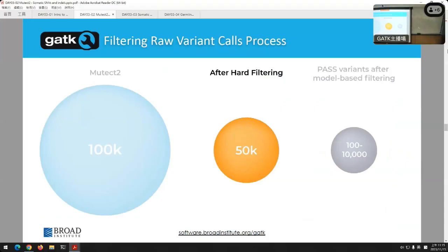Remember, in this case in particular, even more than basic germline calling, we're really trying to minimize those false positives. So even after we come out of our modified haplotype caller in MuTect2, we do another phase of hard filtering that would further whittle down. Like if you start with 100,000 potential variants there, we might get down to 50,000 at that point, just hard filtering.